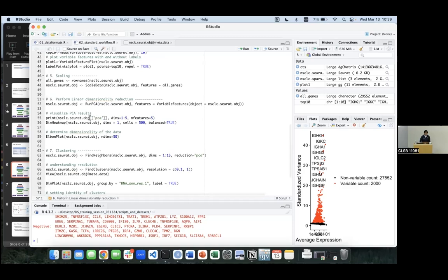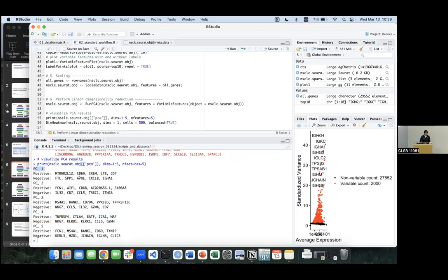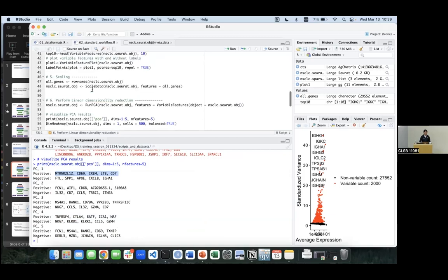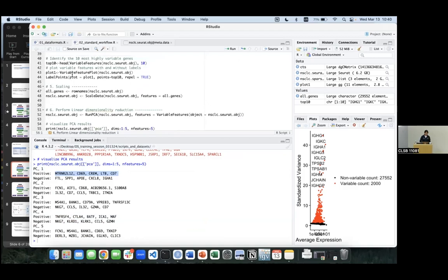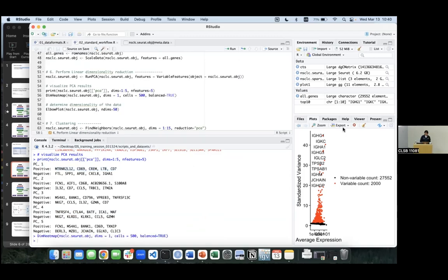Okay, oh, great, it's finished running. We can then print, okay, it runs. So it shows you the top 5 genes of the top 5 PCs, whether they're contributed positively or negatively. It's really useful to dissect the whole PCs, because sometimes, if you're on Twitter, single cell RNA-seq has been bashed recently. But yeah, so you really know what's going on behind all of the statistical numbers. And then you can also plot a heat map here.